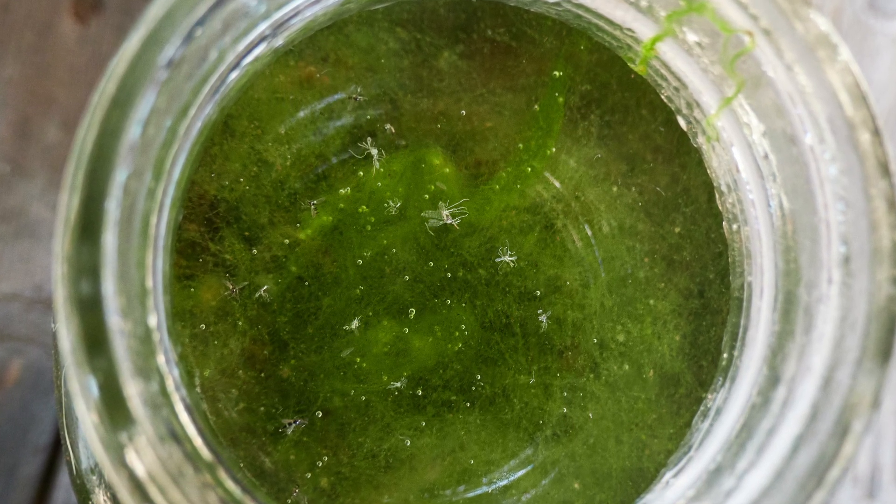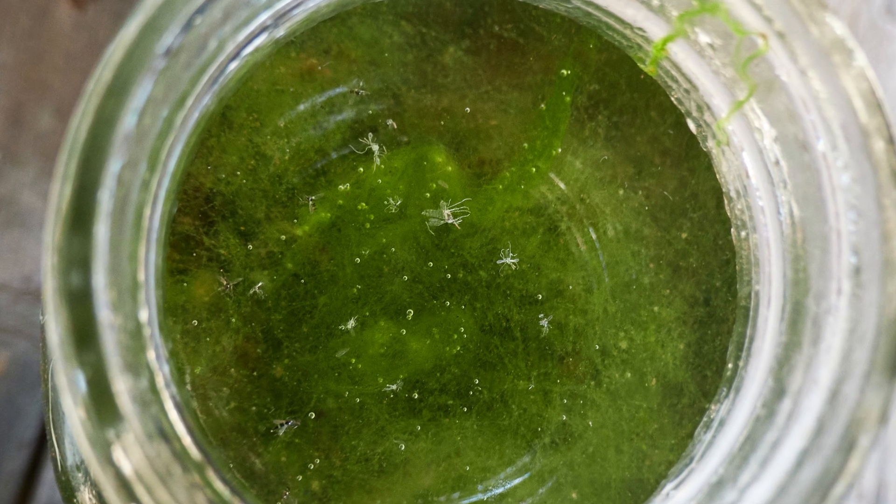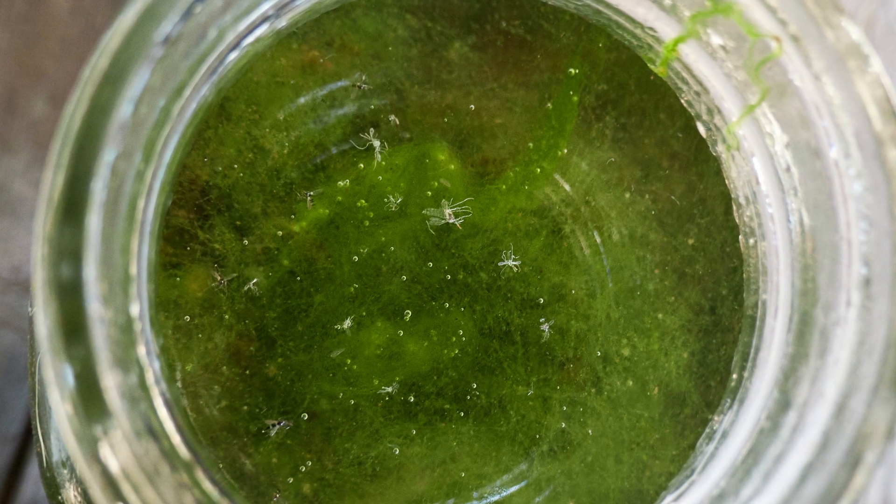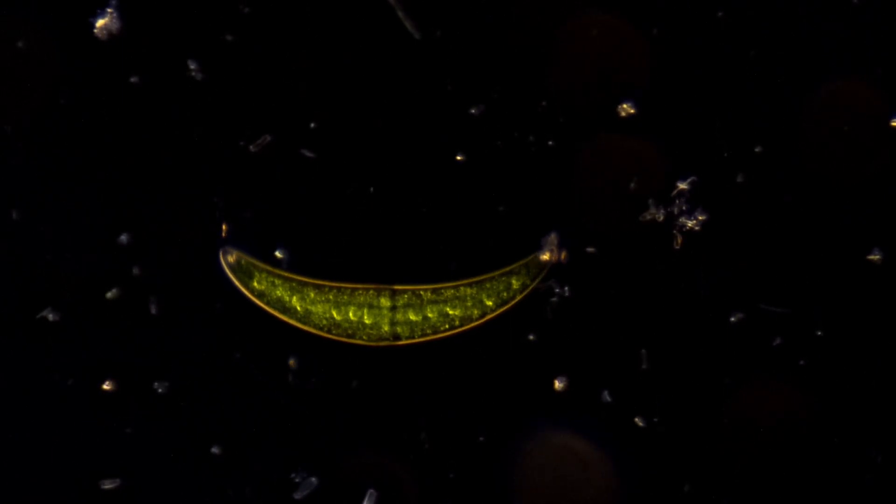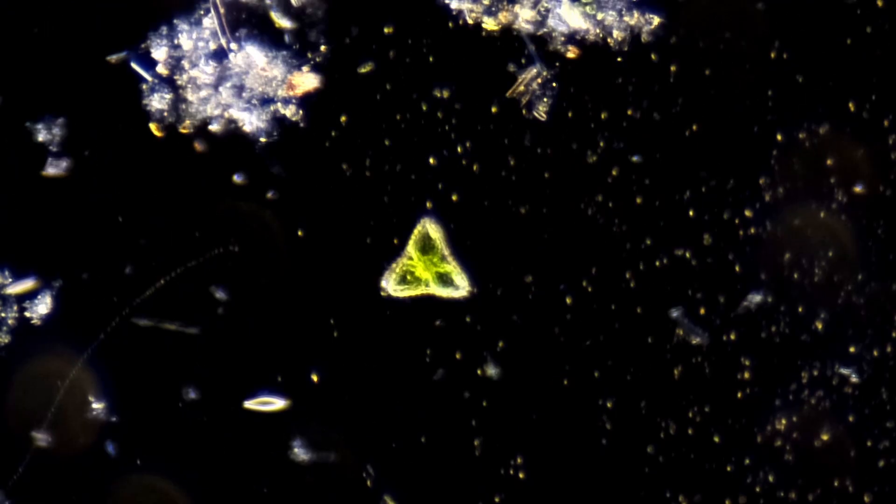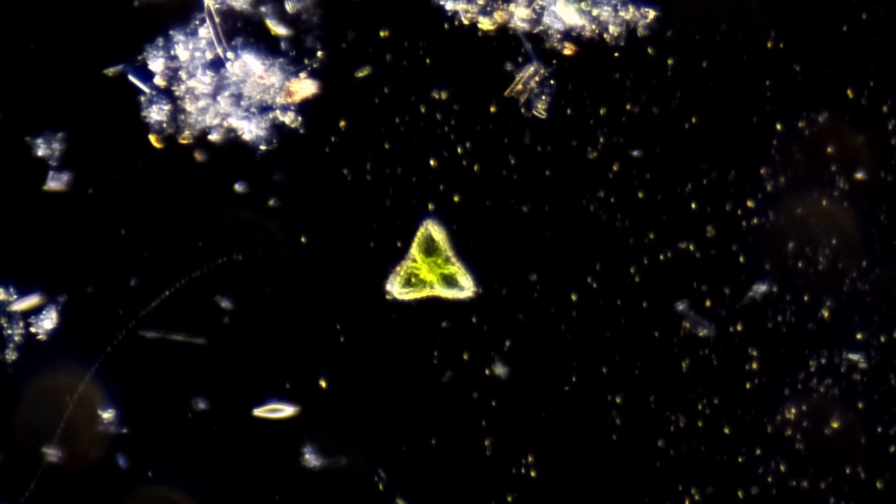It is an example of the tremendous biodiversity nature is capable of in such a small space. But when I drew my sample and brought it up to the microscopy lab and placed it on a slide, huge readily visible algae seemed to predominate. But at the microscopic level, I discovered another story entirely.